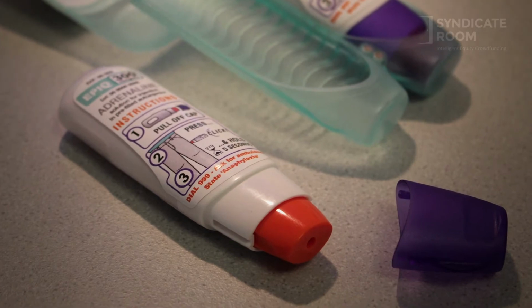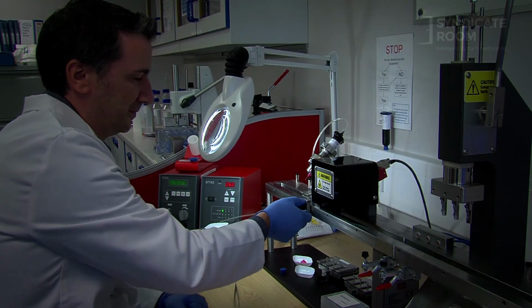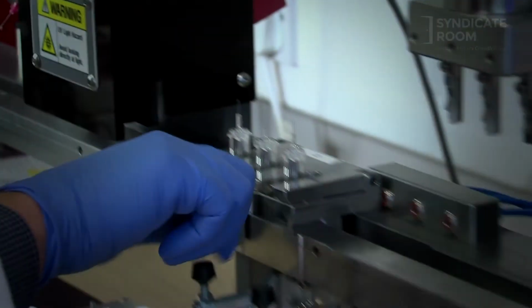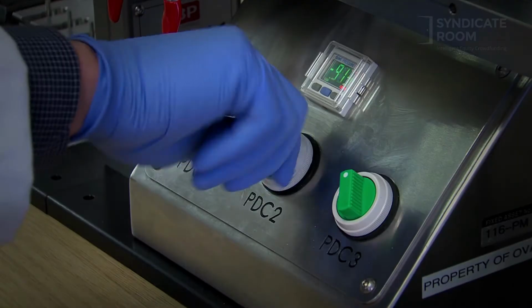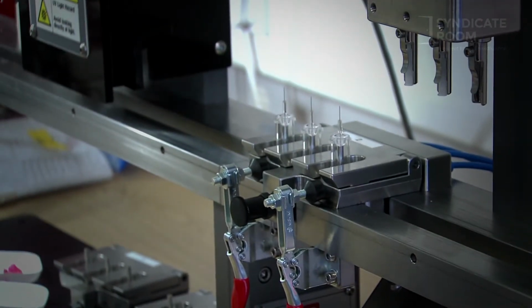One of the essential steps was for us to design the equipment that would seal the foil over and weld it onto the cyclic olefin primary drug container. One other aspect of the manufacturing process is to have an inline check that would test every component to make sure that the filled drug containers weren't leaking. So we'll be able to test 100% of our primary drug containers, and if any of them leak, they'll be rejected and will never get to a patient.